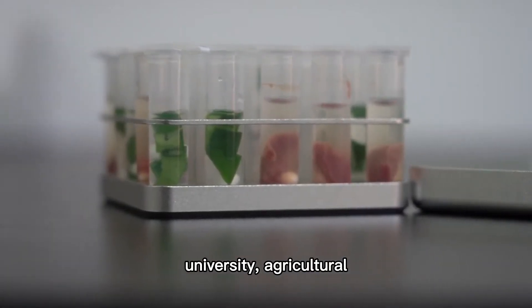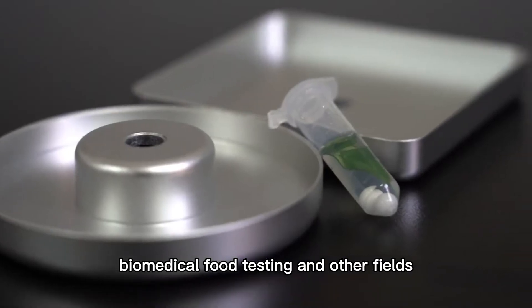This meets the requirements of research institutes, universities, agricultural, biomedical, food testing, and other fields.